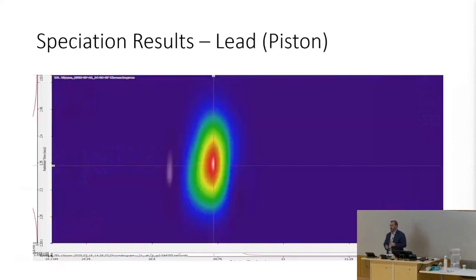All right, let's go into the lead stuff. So for anyone wondering, tetraethyl lead pops up in your chromatograms in beautiful peaks.